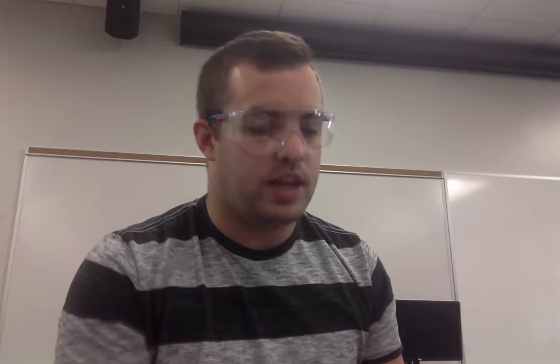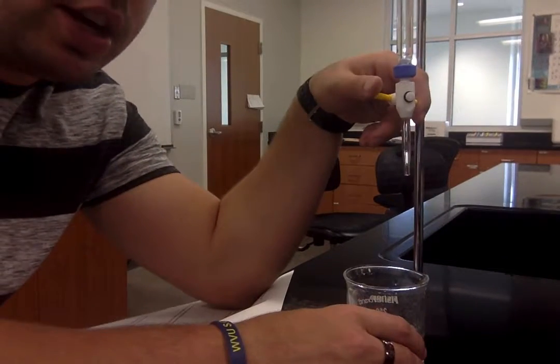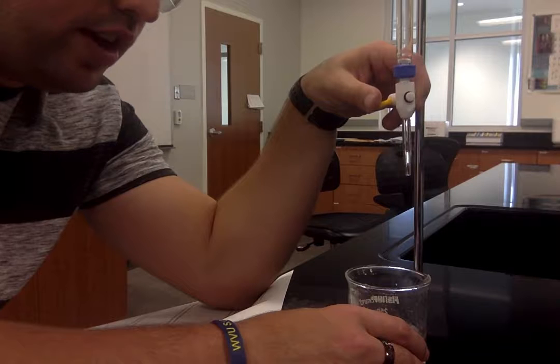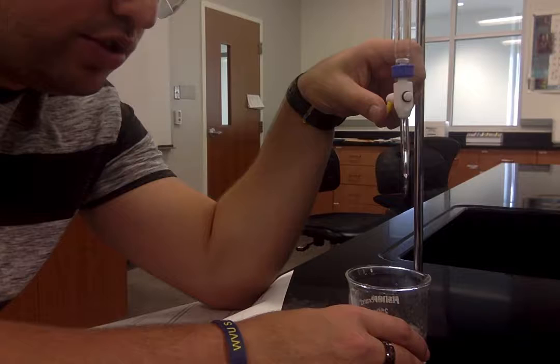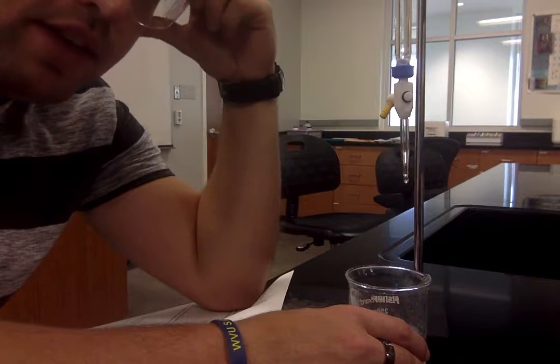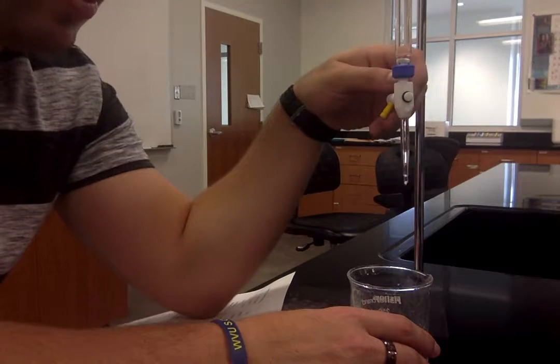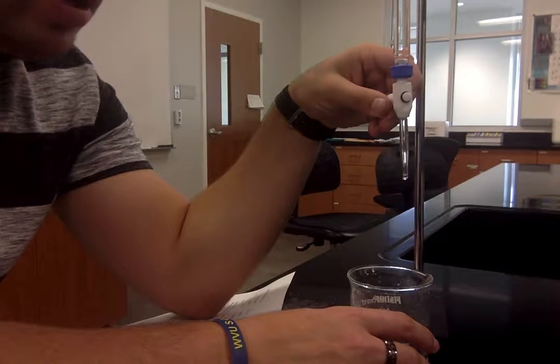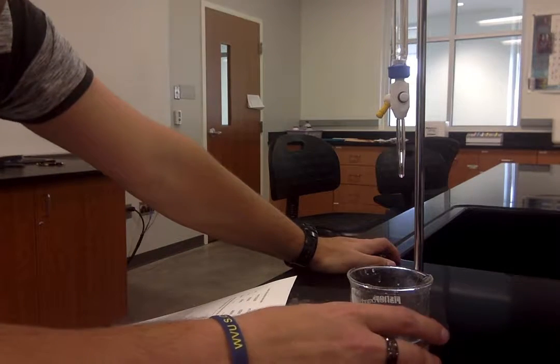Record your initial volume and then titrate it out. You're not going to go very quickly at first — do it very slowly and wait for the drops to come. You can go a little bit faster at first, but as soon as you start to see pink occur, slow it down and go carefully, because the endpoint can be reached in just the matter of one drop.